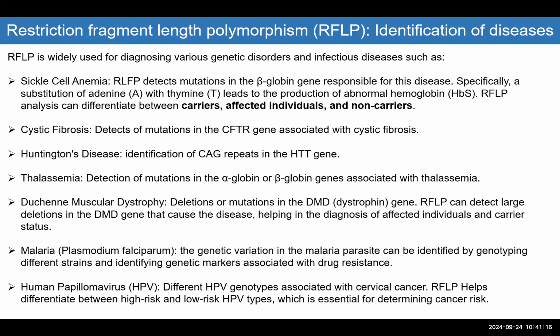The same thing goes for viruses, and you can detect different versions of a virus, especially the mutated versions. You can design probes, and you can tell that this is H1N1 or H2N2 and such. So the applications are really, really wide, and in principle, it's the exact same procedure.